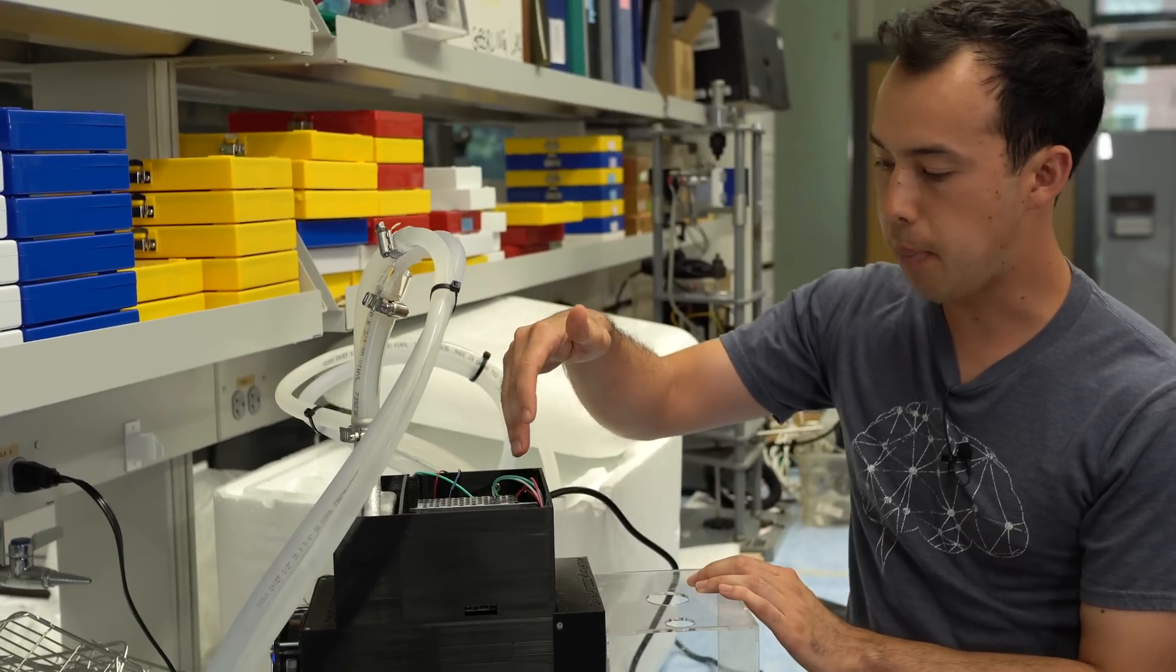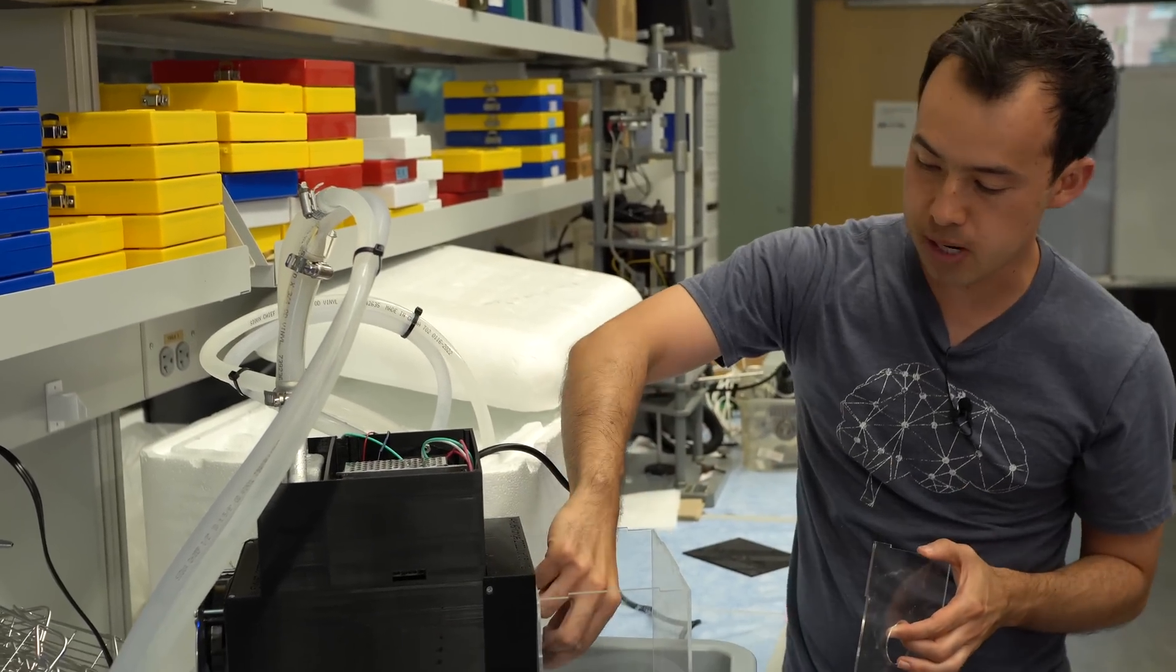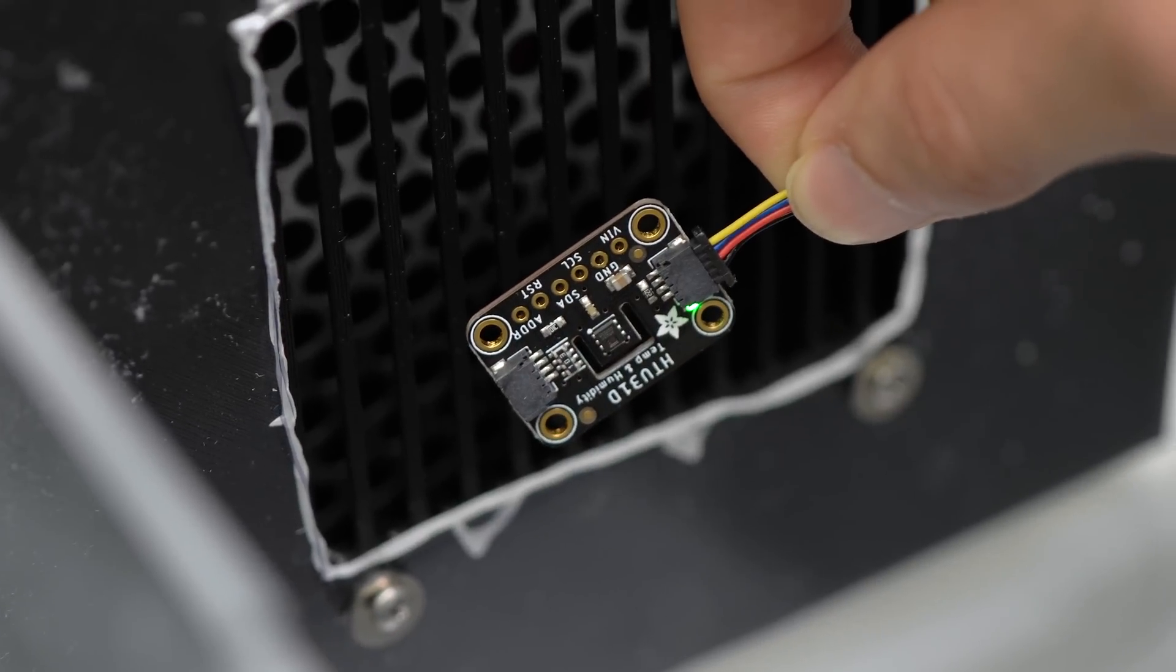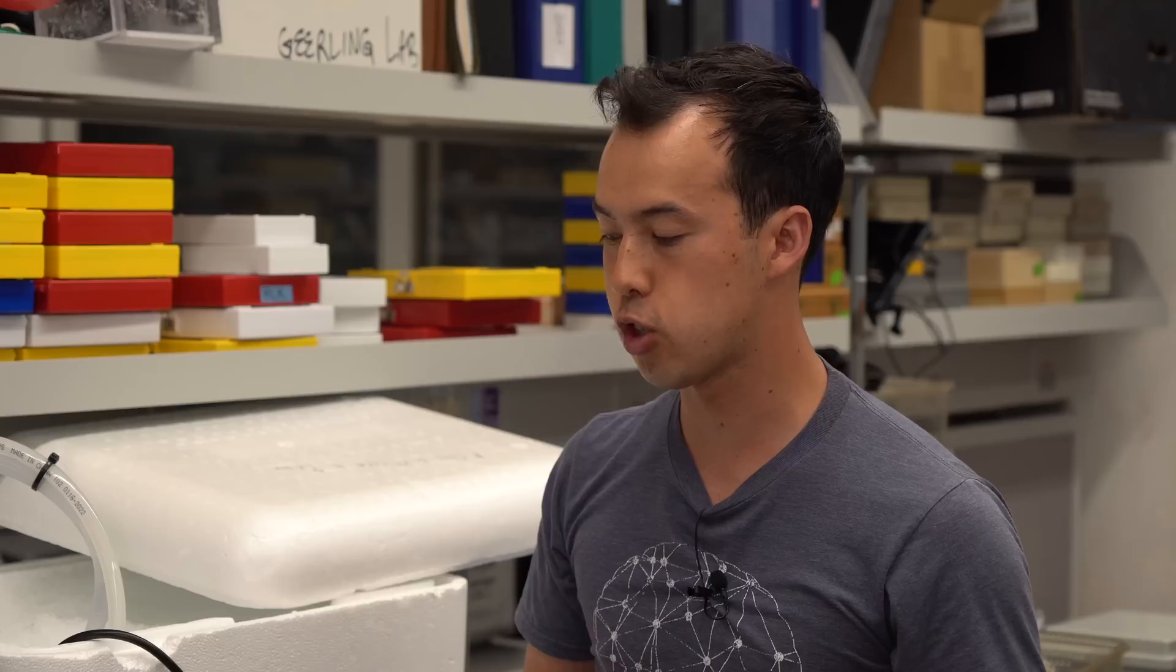So this Raspberry Pi measures the temperature. We have two temperature sensors here. Here's the external one and there's an internal one inside of there. It controls the nichrome wire, the resistors, with a PID loop. So when it gets a little too cold below its set temperature, it ramps up the heaters. When it gets a little above the set temperature, it ramps down the heaters.